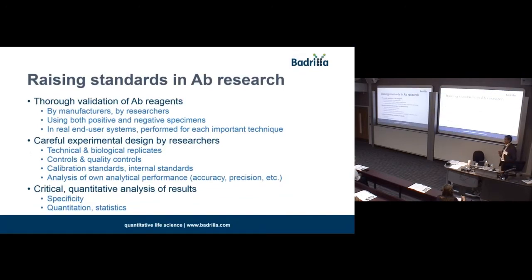So we've been at this for 10 years, and have been developing these calibration tools, which we hope will help validate the antibodies in catalogues. It will allow the experimentalists to conduct well-constructed work, where they can really look at the technical performance of their work, incorporating quality control standards, incorporating calibration standards, and perform the right analyses. So we started thinking about this sphere, the end user, and these calibration standards helping both the execution of an experiment and the analysis. But for this audience, perhaps we're interested in what can it also do for the antibody producers to help them understand the quality of the antibodies they've got.